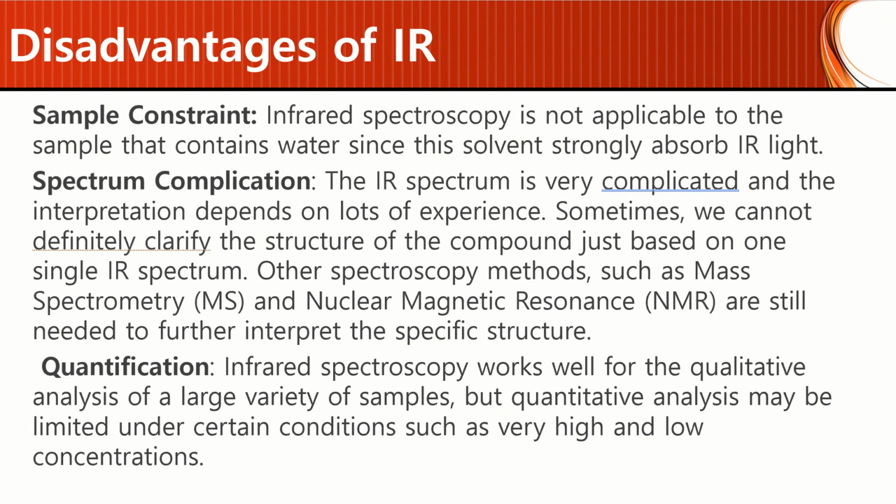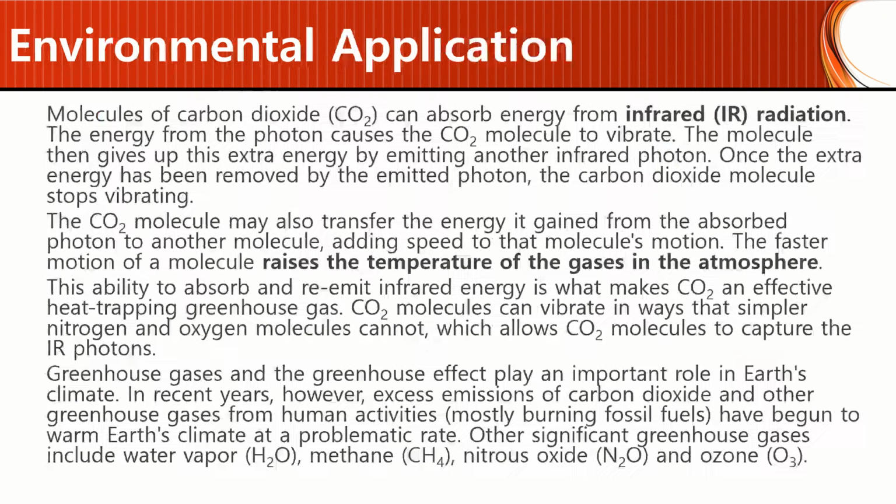And quantification. Well, IR spectroscopy works well for qualitative analysis of a large variety of samples, but quantitative analysis may be limited under certain conditions, such as very high or very low concentrations. So we mentioned that disadvantage already.